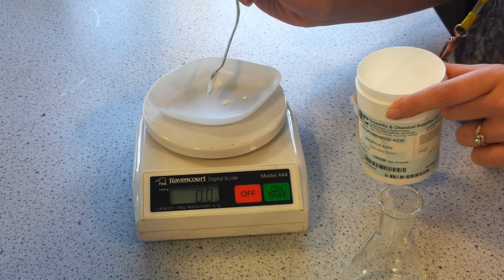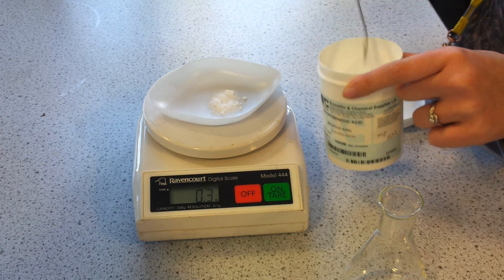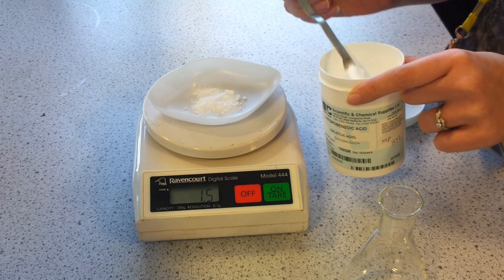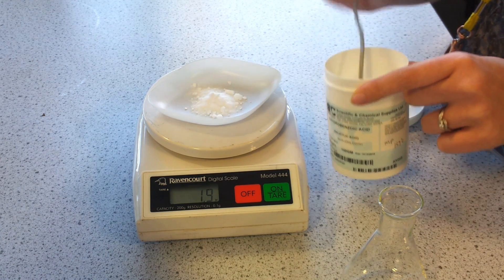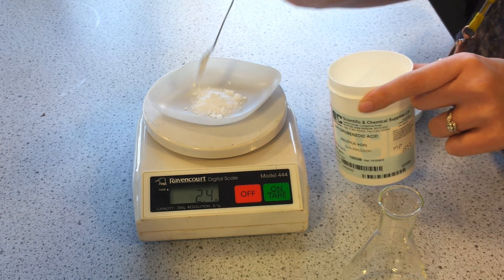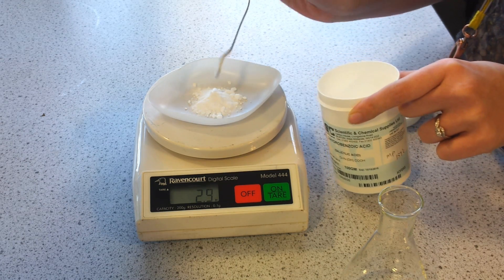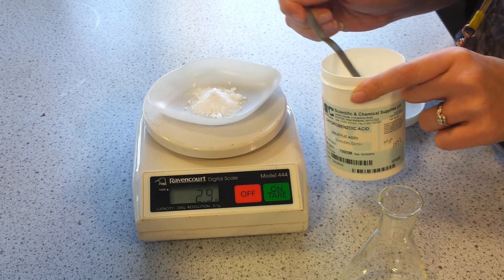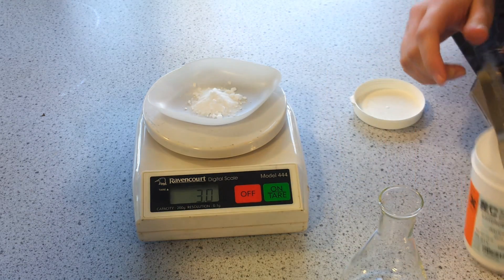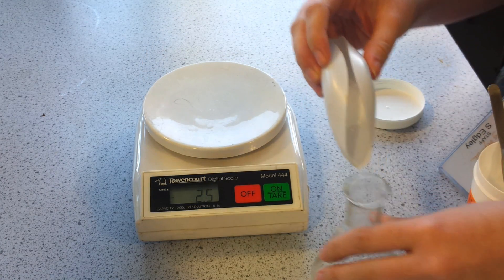First we need to add 3 grams of salicylic acid. Weigh that out, and we're going to put that into an Erlenmeyer or conical flask.